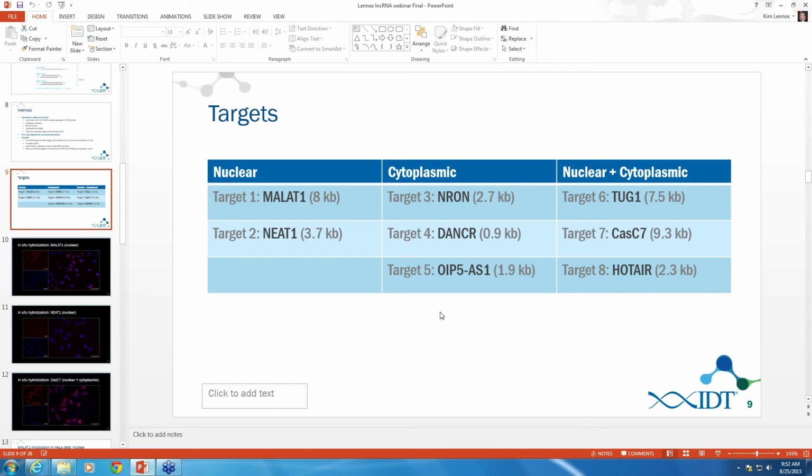And so that's one thing that we're going to also look at, is do different localizations in the cytoplasm affect the ability to knock down with RNAi. But yeah, look up that paper in Cell Reports in 2014, and the data is very convincing that RNAi will work in the nucleus. The question is does it work better in the cytoplasm versus the nucleus, or for long non-coding RNAs, does it matter? That's pretty cool, a good question. Yeah, cool. All right.